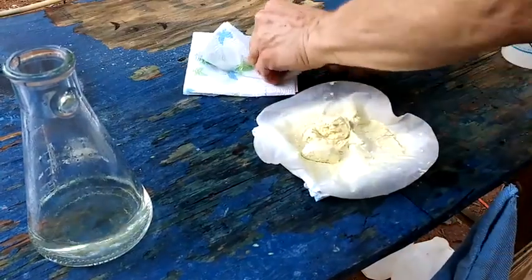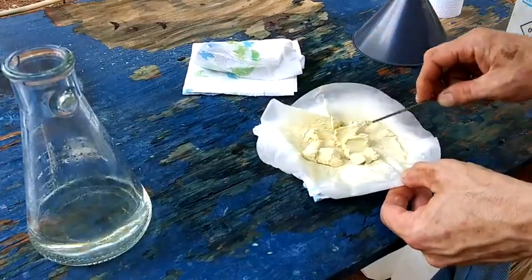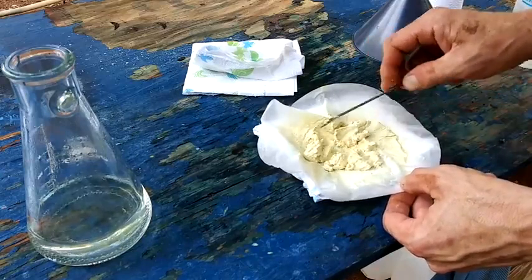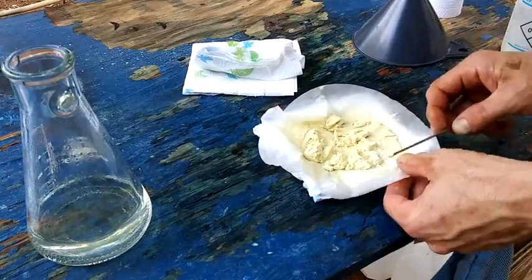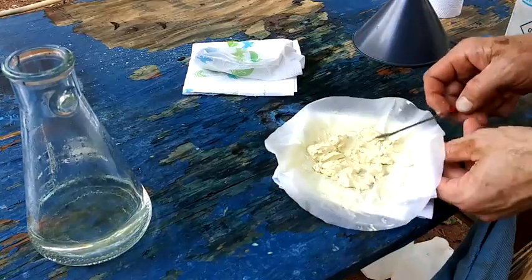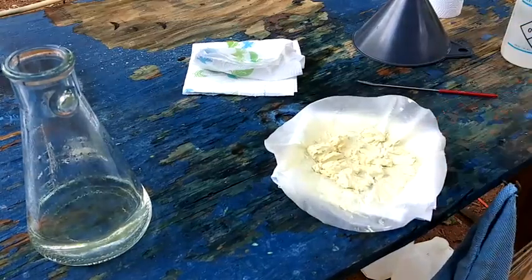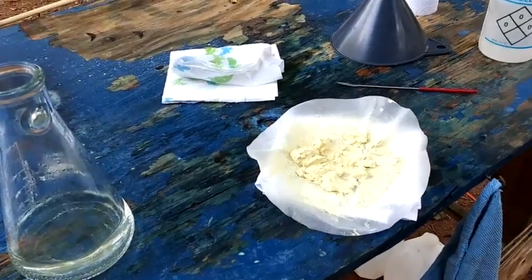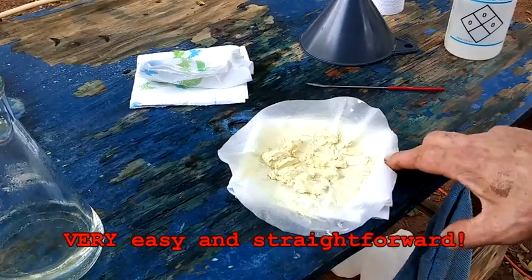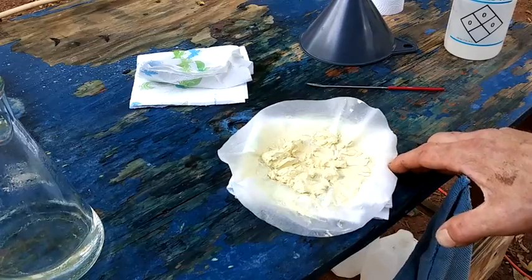And of course, you do want to break it up some. It's kind of a thick, gooey paste. Kind of like wet clay. And there we go. Bismuth Trioxide. Synthesis is pretty easy and straightforward. I'm just going to go ahead and put this in a desiccator now so that it can dry out. But essentially, this one is done.